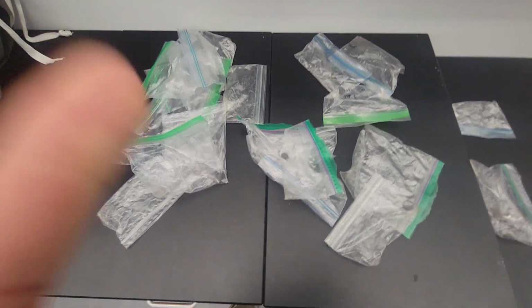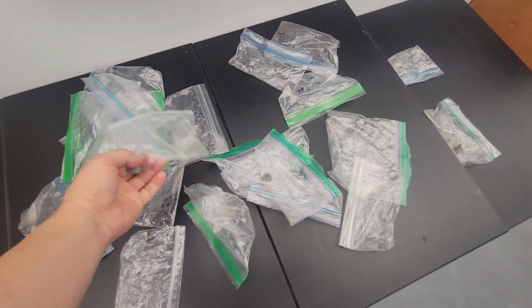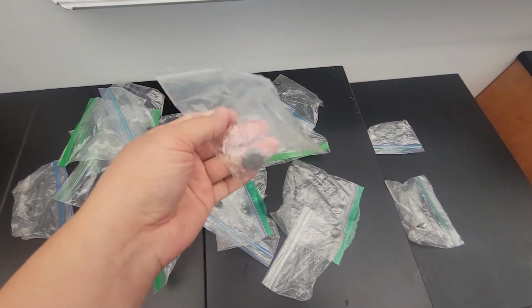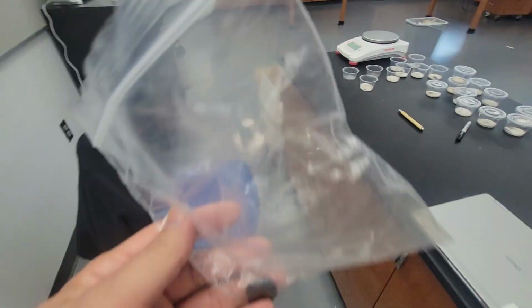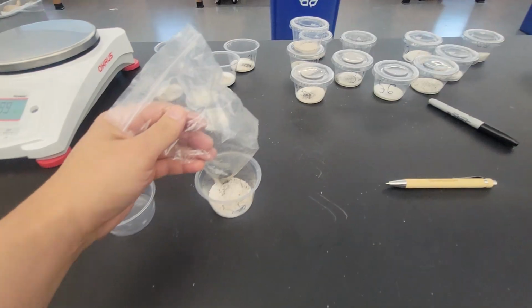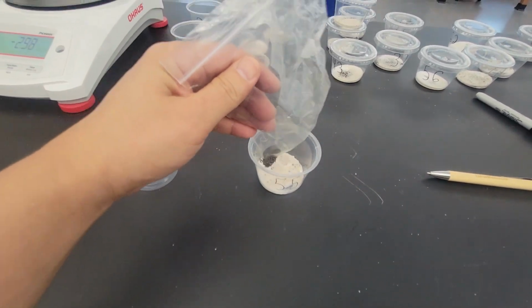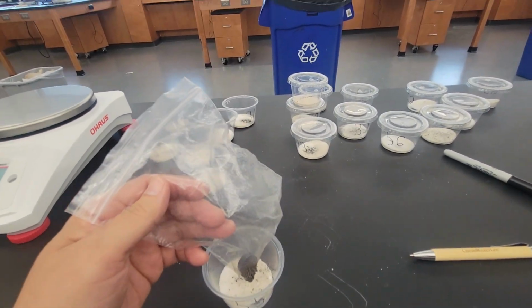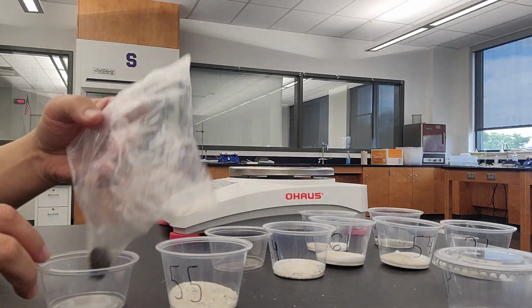I had a pile of magnets here. Just grab one of these in a sandwich bag, so as to not cover them up with iron. Now, I'm going to need both hands, so I need to change the camera angle.